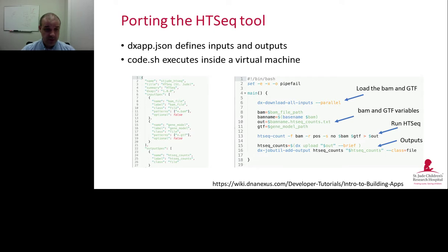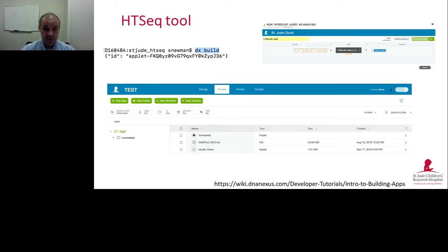Now, for the non-programmers out there, you may find this to be quite challenging, and there is a little bit of a hump to get over. But I think you need a relatively low skill level to be able to do this. For the bioinformatics professionals who might be listening, I hope you'll agree that this is quite a straightforward procedure. Of course, what I've demonstrated is just the tip of the iceberg.